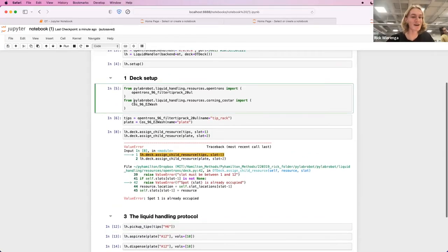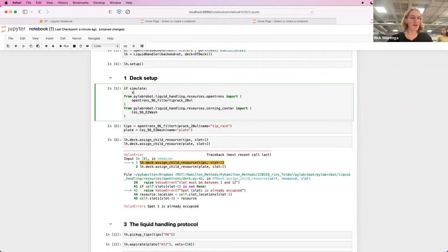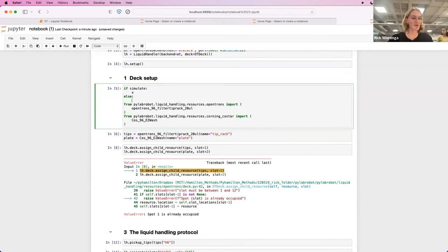You could imagine in a real script, something like a flag, like if simulate do X, else do Y. Just for the simplicity of running everything in a notebook and highlighting the differences.